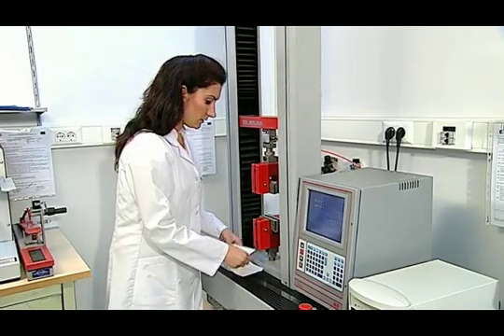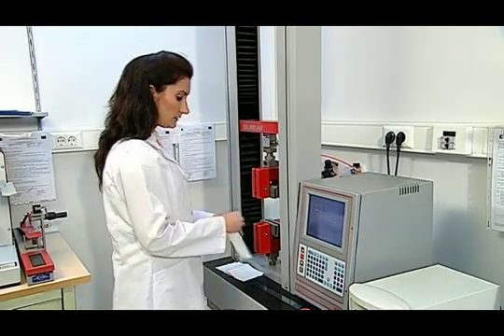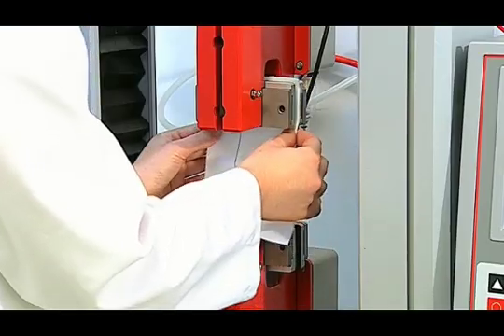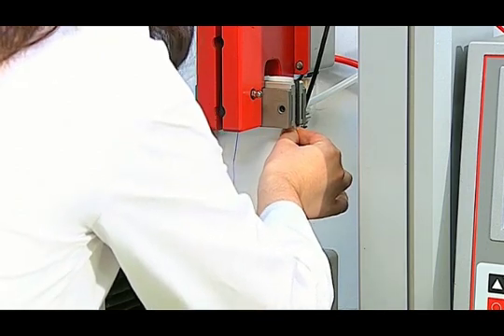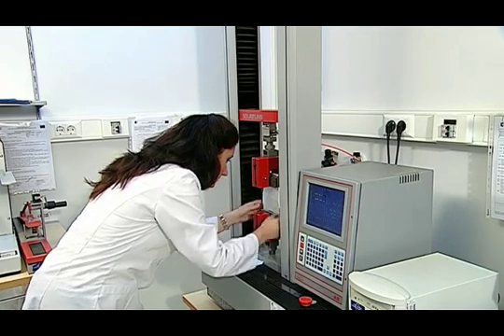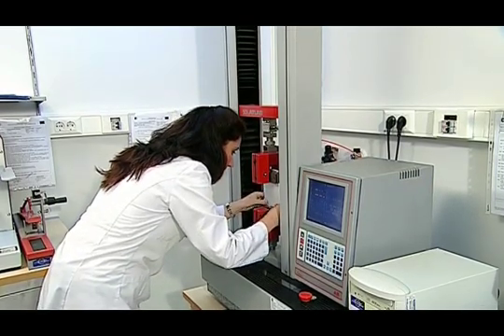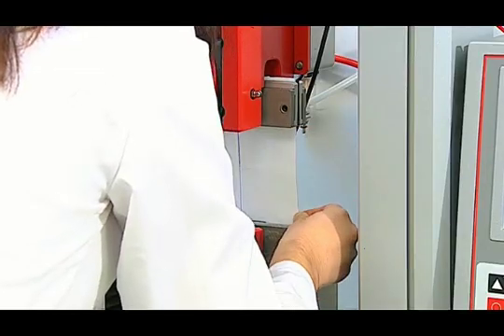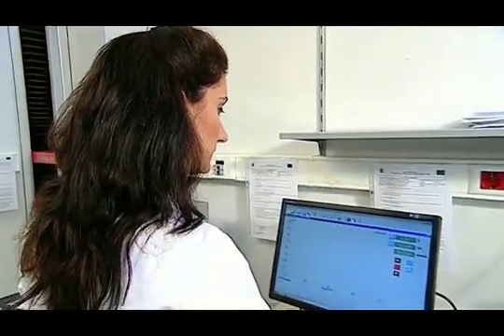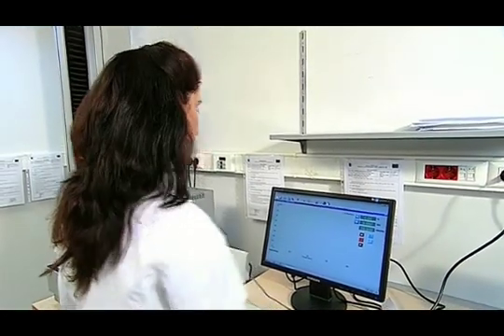At the next stage, the stitched and non-stitched samples that we have prepared are placed in the device. First, the seamless sample is placed in the device. It must be made sure that the sample placed in the device is parallel to the grid lines. Samples must be placed in a manner that they are not too loose and not too tight; there must be no initial stretching in the fabric. Then, the elongation and strength values are reset in the computer, and the OK button at the top is pushed to start the test.